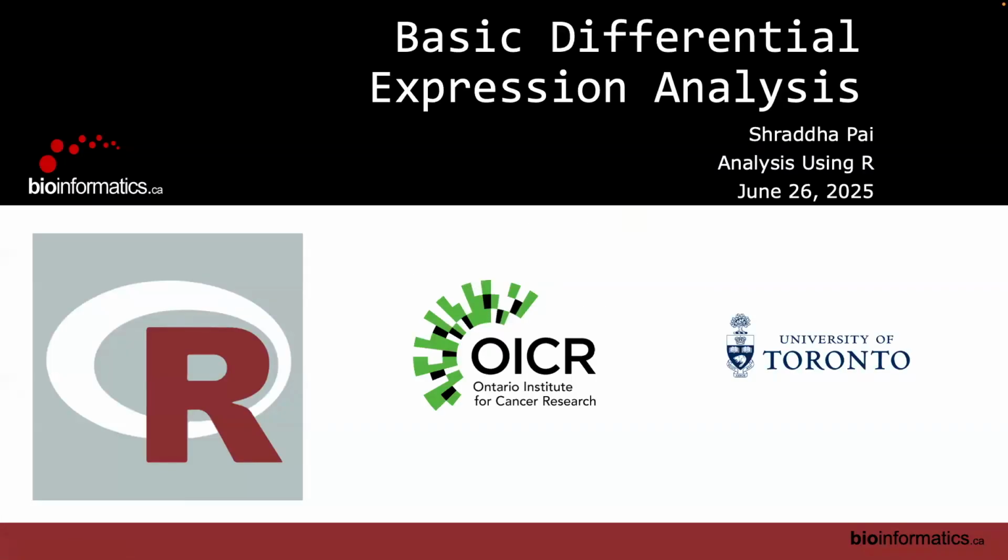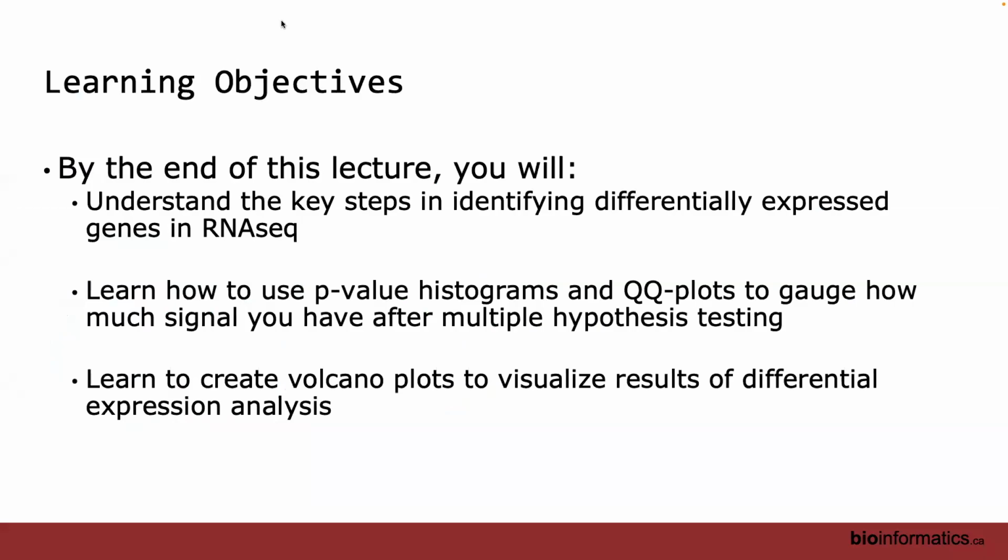So basic differential expression analysis is the title for this, but a lot of the concepts can apply for other omic analysis, right? What's the difference between omic analyses and non-omic analysis is that traditionally we focus on one molecule and we do the testing for that. But omic allows you to test a set, the entire transcriptome, the entire proteome, et cetera.